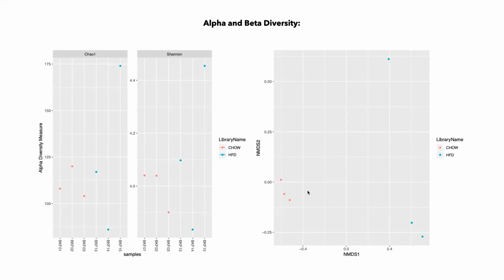So we have two ways of looking at and comparing these microbial communities. One way is to look at abundance at a particular taxonomic level. Another way is to actually look at diversity. So the more diverse something is, or the less diverse something is, does it actually tell us something about the groups of samples? Okay, and yes, it does. Groups of samples here are very different, right? In other words, we can just draw a simple line and completely separate two of these types of samples.